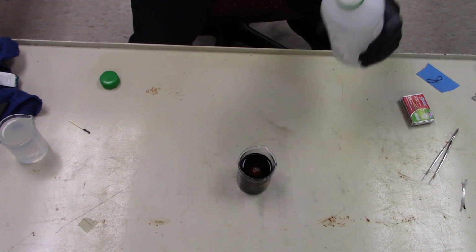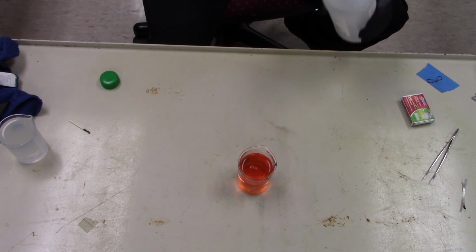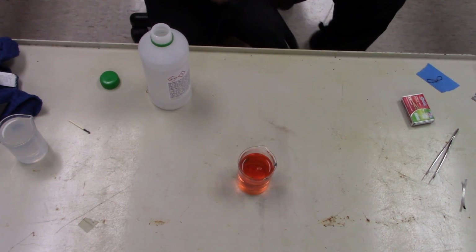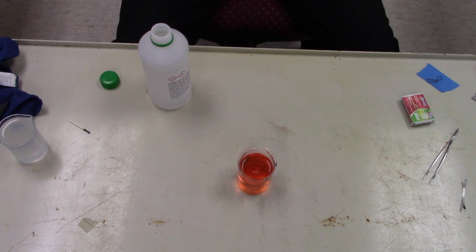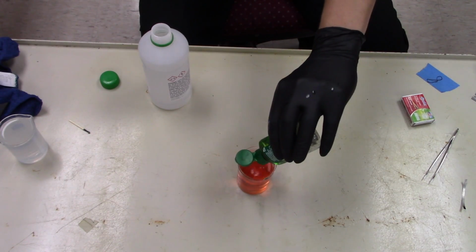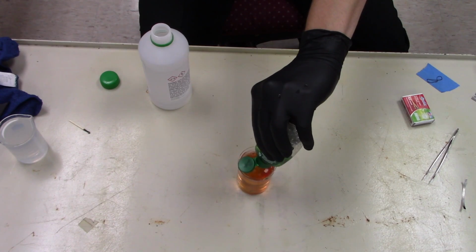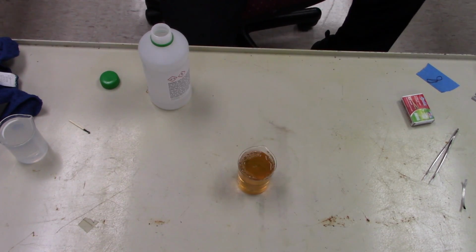You should put it in slow-mo. Ta-da! So it goes from blue to yellow in the presence of acids. I don't know if this will work, but if I take a basic material like cleaning agent, it might go a little bit back to blue, but probably not. A little bit. You see how it's diluting the color of it a bit?